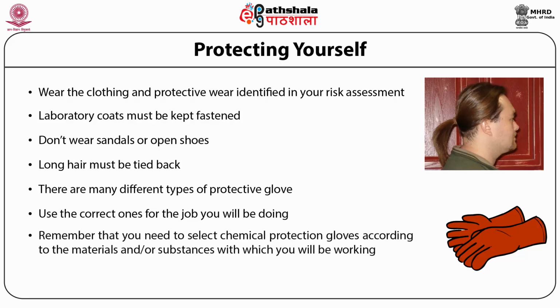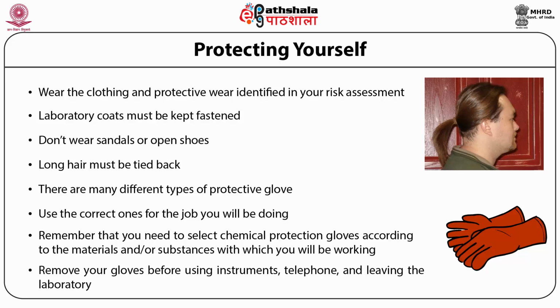Remember always that you need to select chemical protection gloves according to the materials or substances with which you will be working. Always remove your gloves before using instruments or the telephone, and before leaving the laboratory.